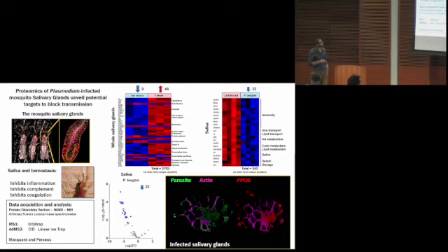One thing that was interesting is that of the classical saliva proteins, from up to 60 proteins that you can find, only 4 were differentially expressed. But many other proteins that are secreted were differentially expressed. And overall, this proteome had a good correlation with other transcriptomes that were published, around 60%. So these results suggest that the parasite can impact the composition of the saliva.